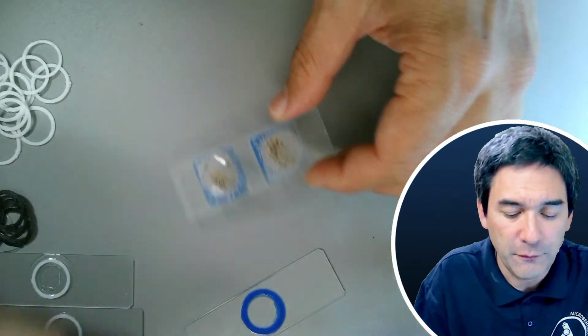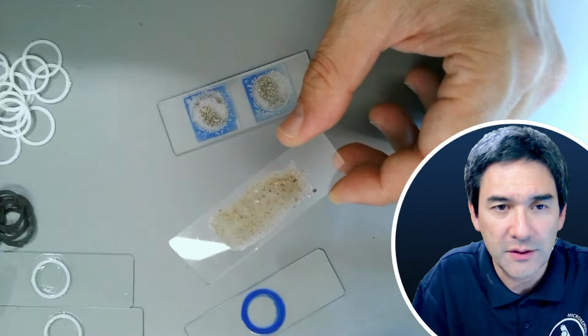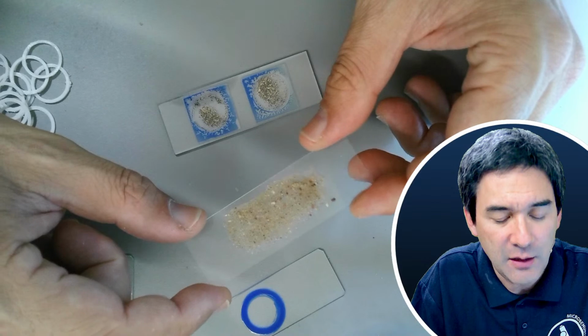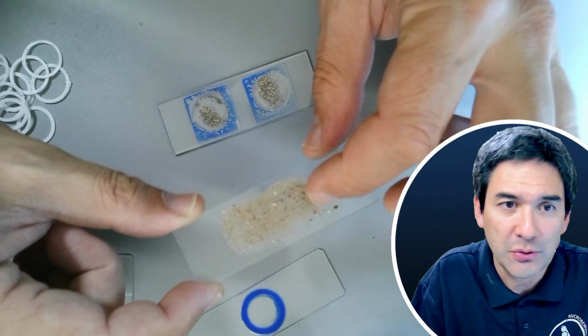I've also made the following before. You might have also seen this. Here I applied a little bit of glue on the slide, and then I sprinkled the sand on top, and now the glue holds the sand grains in place. This, however, has a little disadvantage: you're also able to see the glue.